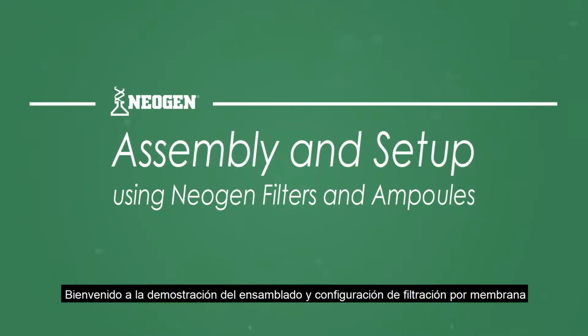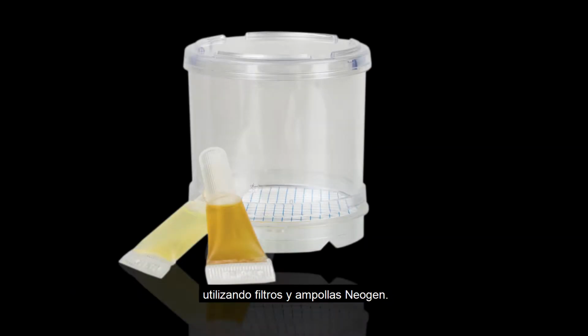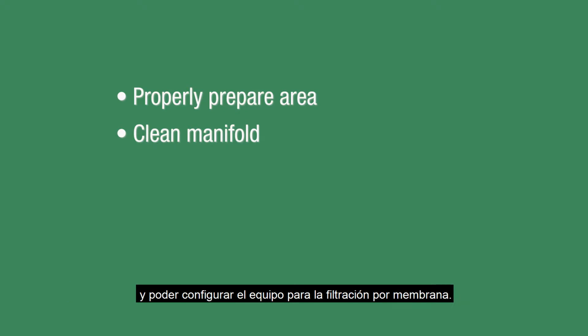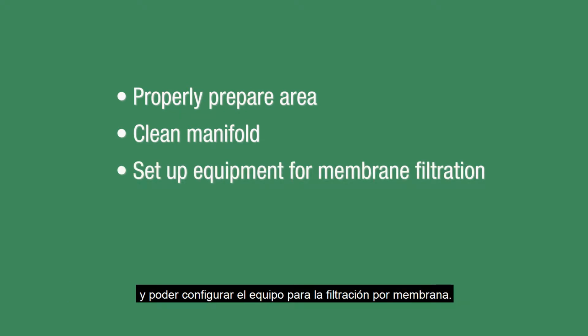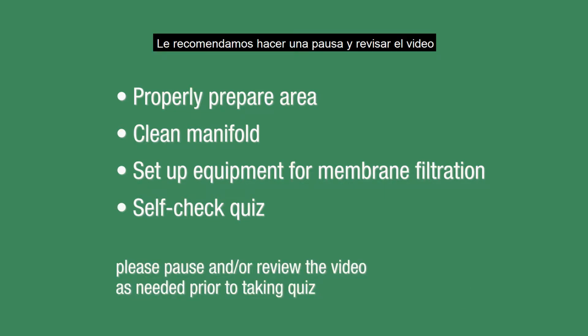Welcome to a demonstration of the assembly and setup for membrane filtration using Neogen's filters and ampules. By the end of this video, you should be able to properly prepare your area, clean the manifold, and be able to set up the equipment for membrane filtration. A short self-check quiz follows the presentation. We encourage you to pause and review the video as needed prior to taking the quiz.